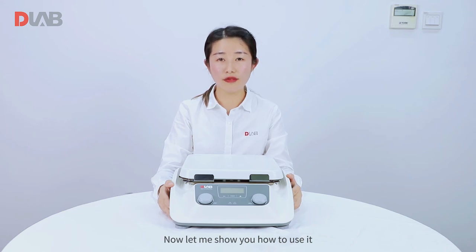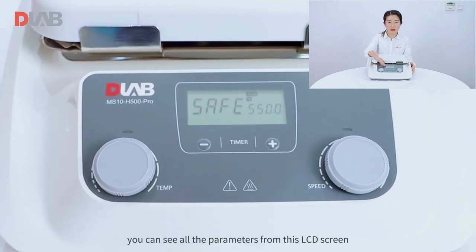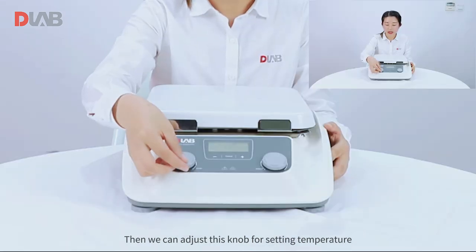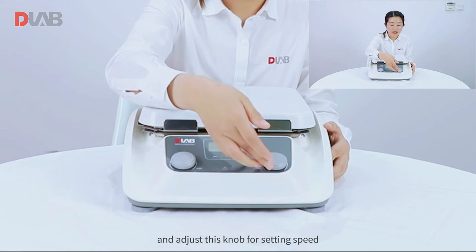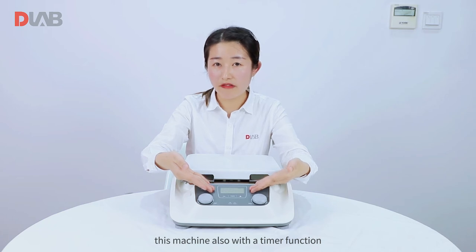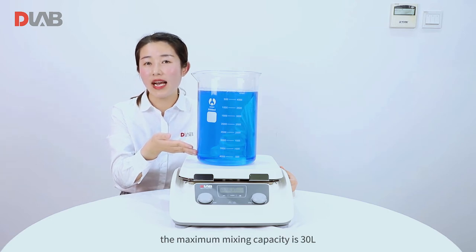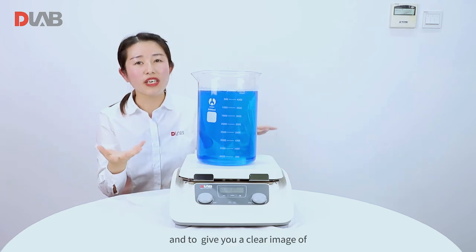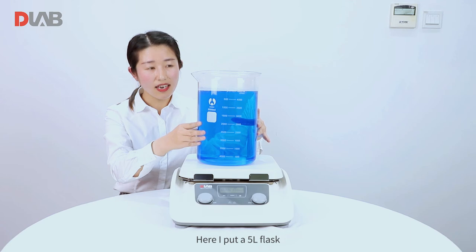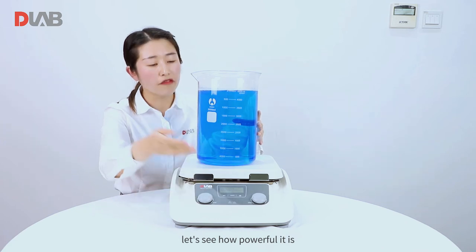Now let me show you how to use it. First, turn on the machine. You can see all the parameters from this LCD screen. Then we can adjust this knob for setting temperature and adjust this knob for setting speed. This machine also has a timer function. It's also very powerful — the maximum mixing capacity is 30L. Here I put a 5L flask with water inside and set 800 RPM. Let's see how powerful it is.